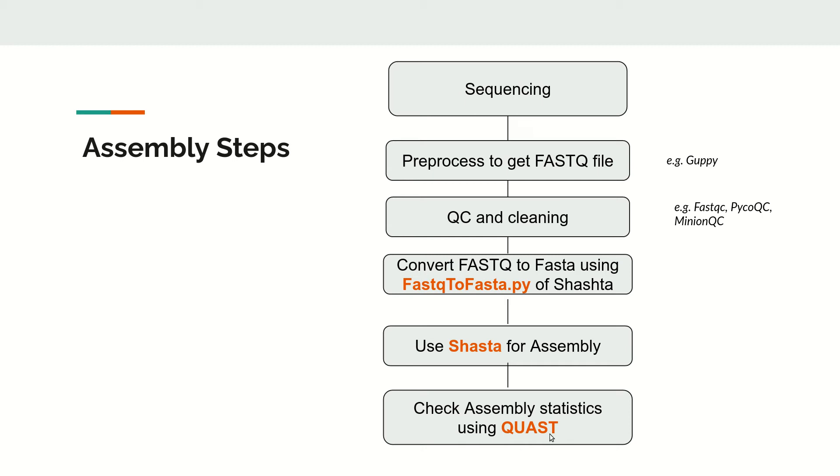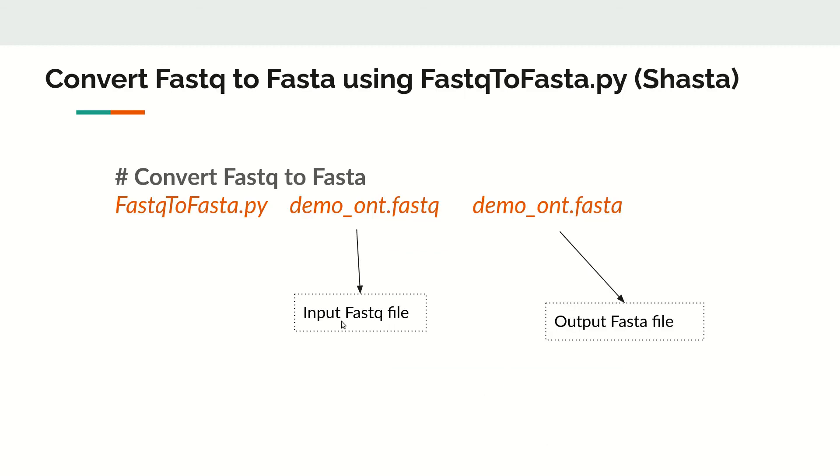The first step is to convert FASTQ to FASTA using the script provided by Shasta. The command is simple: pass the script name, then the input FASTQ file, and give the output FASTA filename. In this demo, we use a file called demo_ont.fastq and convert it to FASTA format. Once we have the FASTA file, we move to the next step.